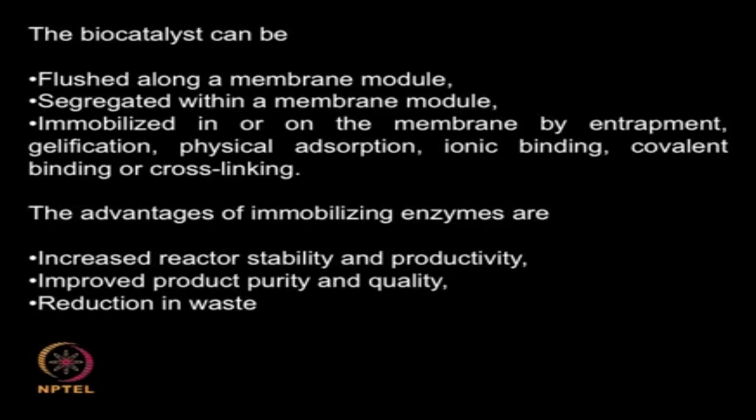So what are the advantages? We can increase reactor stability, we can increase productivity, we can have improved product purity and quality, we can have reduction in waste, the product can be continuously removed. So if the product is toxic to the biological molecule or it is an inhibitor to the biological molecule, by continuously removing it we are preventing its accumulation.